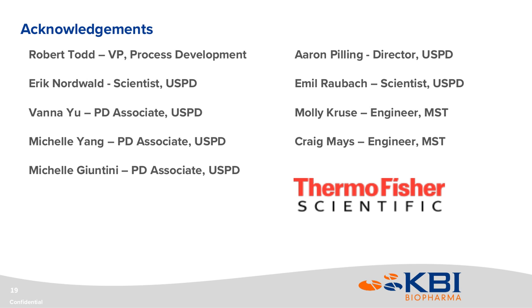The SUF improves this high run rate model by allowing us flexibility in terms of scheduling for both process development and higher throughput than traditional stainless systems. So in terms of flexibility and scheduling, that allows the client to get their project into a GMP space much quicker than we would for traditional stainless systems. I hope that answered the question.